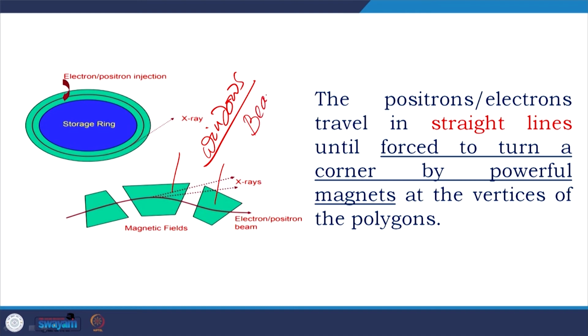In the windows there are beam lines. I was working at Argonne National Lab, APS, where we used to work on a beam line. In every synchrotron they have certain beam lines where crystallographers work. They go there and they collect their data. We will talk later about the speed of collection.